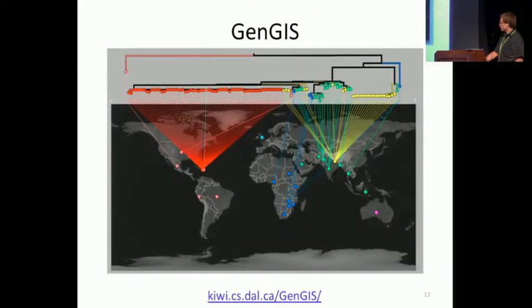We also interact with some other tools. Genghis is a desktop application for integrating geographic and phylogenetic information. So there's a plugin in Genghis that was written which will interact with IRIDA over our API to download a phylogenetic tree and geographic information for any samples you have and be able to display it in a few different customized views that have been in development.